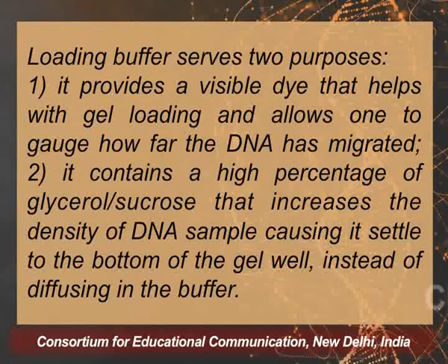It contains a high percentage of glycerol or sucrose that increases the density of the DNA sample, causing it to settle at the bottom of the well instead of diffusing into the buffer. Again, the loading buffer can be made at a higher concentration, usually 6x, and 1x is used in each DNA sample. The electrodes are then put into the voltage source and the gel is run.